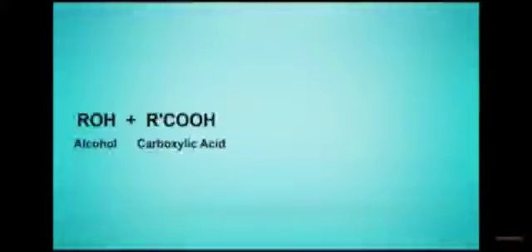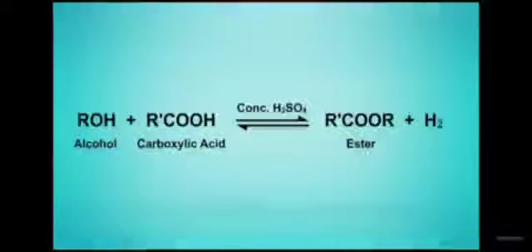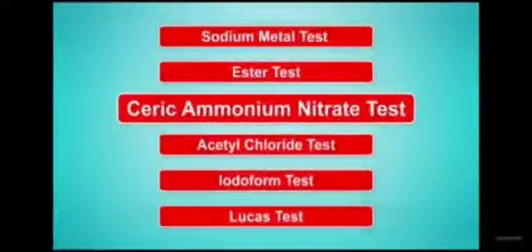Alcohol reacts with carboxylic acid in the presence of concentrated sulfuric acid to form a fruity smelling compound called esters. Waft it and you will smell a fruity smell, which indicates the presence of an alcoholic group.